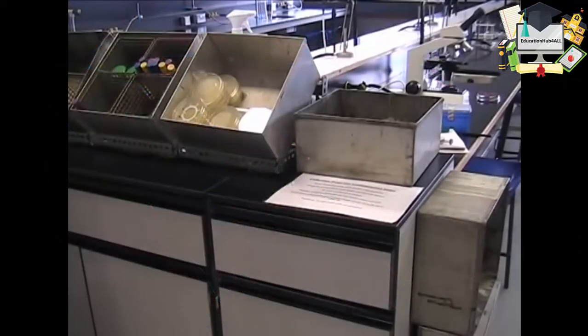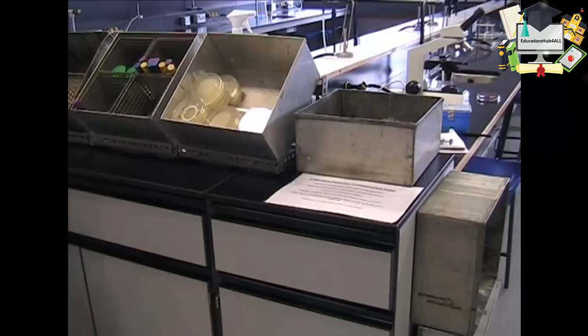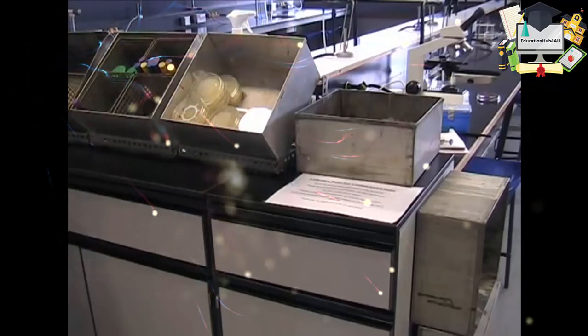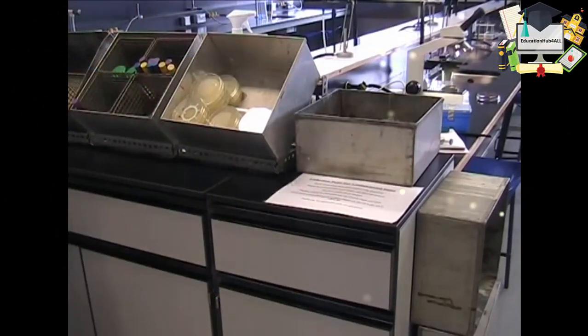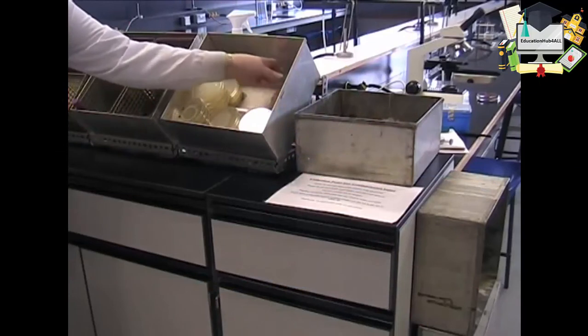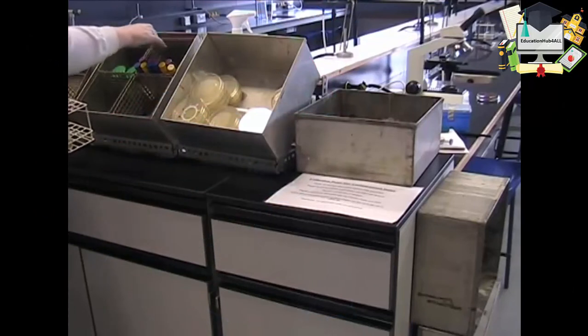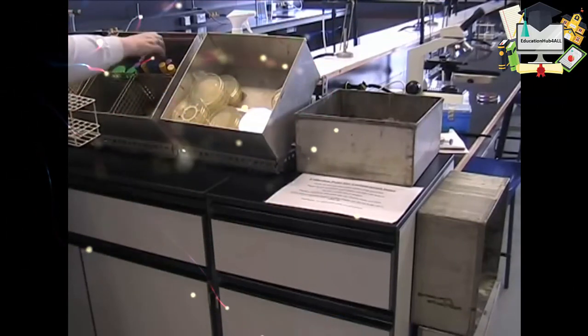We're now going to discard all our unwanted items. You can see here we have a tin that has plastic Petri dishes and agar plates inside it, and we have a tin with baskets that has small bottles and test tubes in it. It's important to remember not to mix these items up, as when they're disposed of from the autoclave, it can cause a nasty mess if the plastic melts all over the glassware. So place your unopened plates into the tin and you're ready to go. Any test tubes should be placed in the tin with the basket.